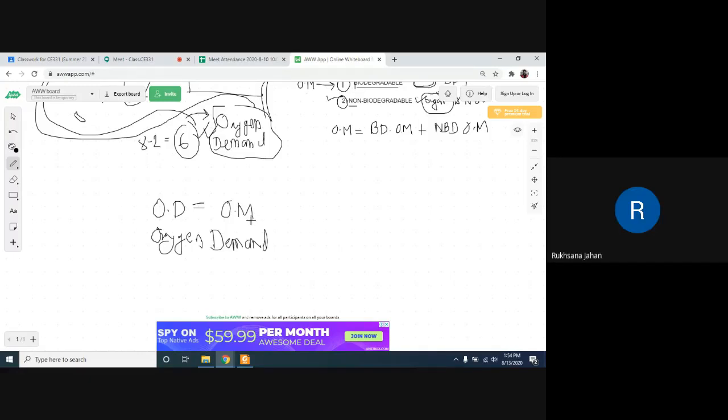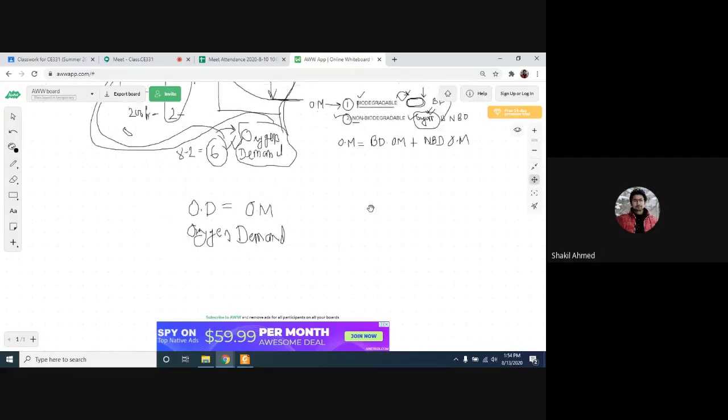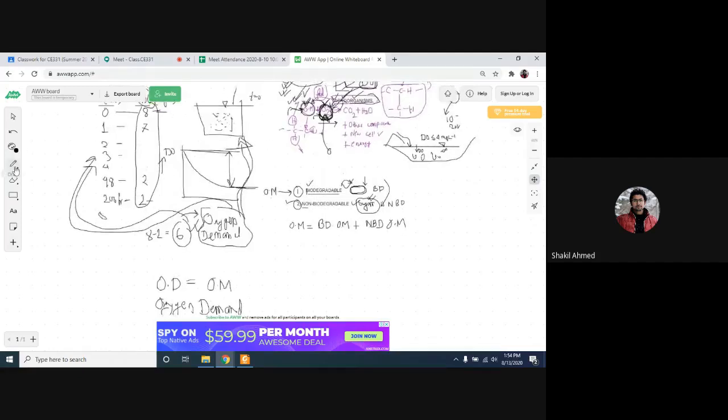Yes, sir. Now, let's come to the point. In this reaction, microorganisms are degrading the organic matter. That means which type of organic matter is this? If the microorganism can oxidize this organic matter, is it biodegradable or non-biodegradable?